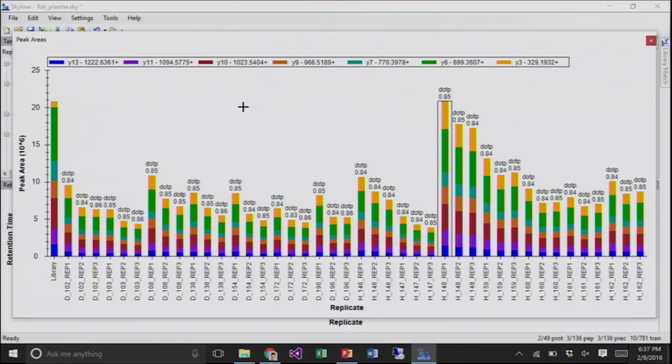No. And so what is sort of systematically happening in all cases for this peptide, at least? There's a pattern there that you see a systematic decrease from the first to the third. Yeah, systematic decrease. We see this slope. So we seem to be losing signal, right? So just keep that in the back of your mind. It's going to become important later.